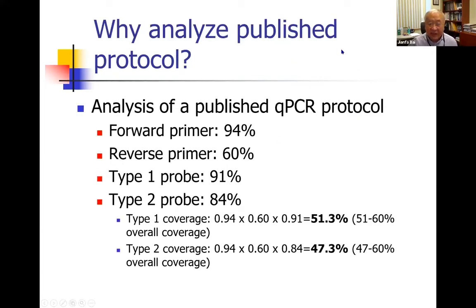We are molecular R&D. We are building molecular assays all the time. But one question we were asked is, why? Why do you need to do this? Because when you look at the literature, there is tons of literature. Why don't you pick one and use it? So in this one example, I try to explain why we design the primers and probes ourselves.